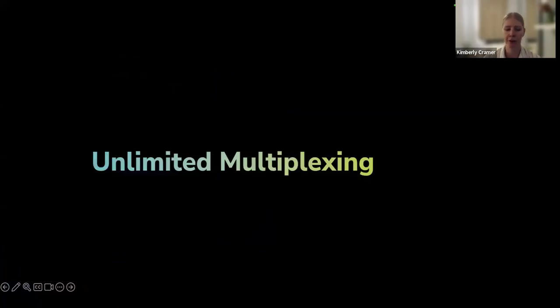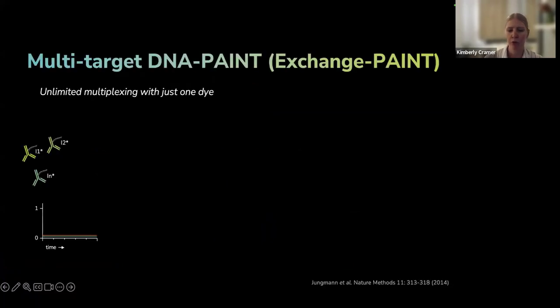Another key advantage of DNA paint is its unlimited multiplexing capabilities. And this is, in my opinion, where it can really, really shine. So if you want to image multiple targets in DNA paint, you're not changing the dye. You can actually do unlimited multiplexing with just one DNA paint dye. Instead of that, you need to change the DNA paint sequence.